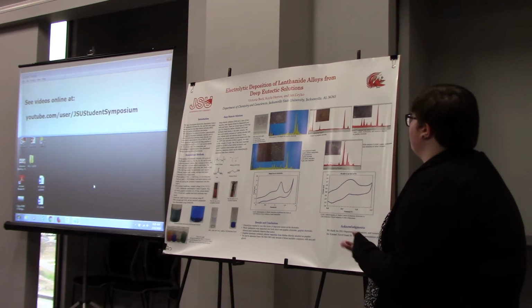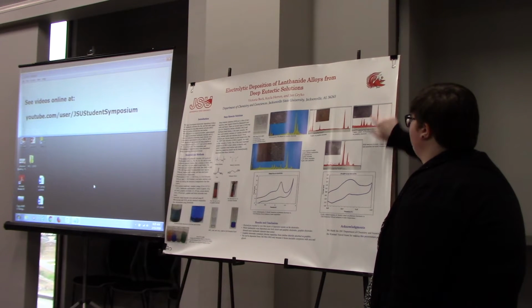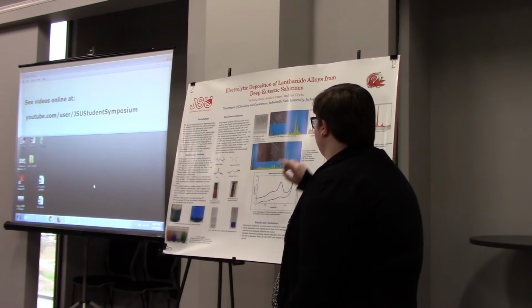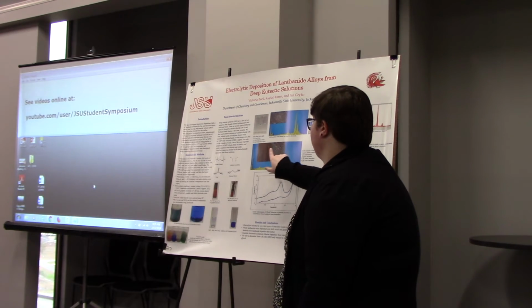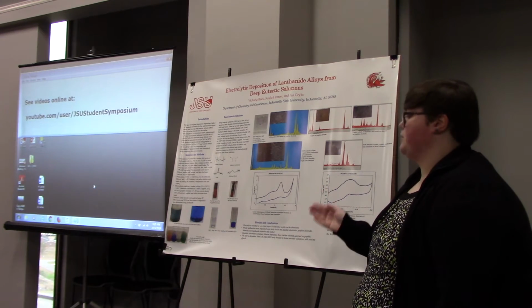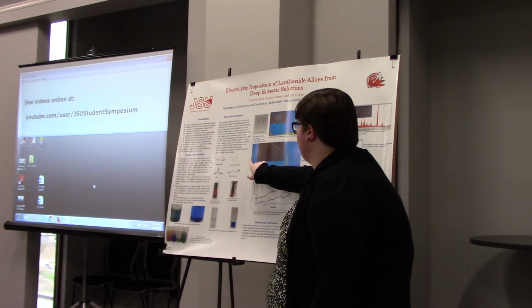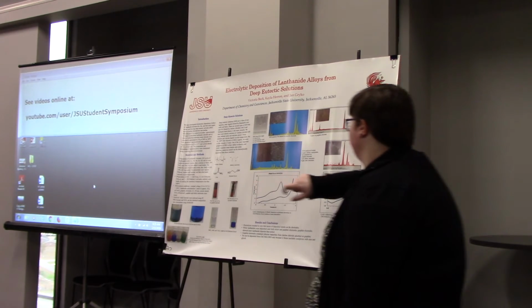This is copper, cobalt, neodymium, and samarium on graphite electrode. There is a lot of copper, and there's a pretty good amount of lanthanides deposited there too. This is copper, erbium, neodymium, and samarium on graphite electrode. This is before sonication and this is after sonication. All sonication did was remove the layer that was not actually deposited onto the electrode. So we have a lot of copper on this one and some lanthanides, and then again this chlorine right here.